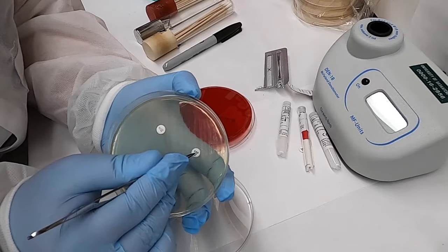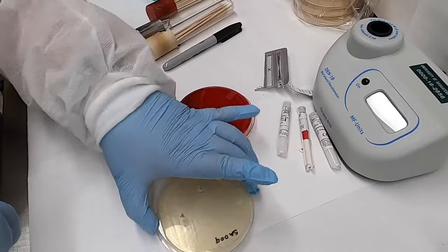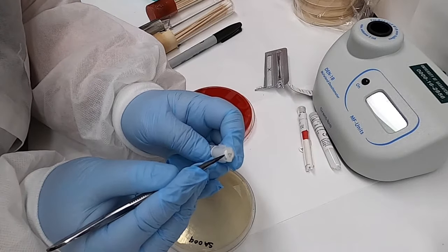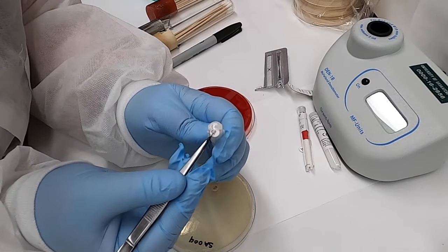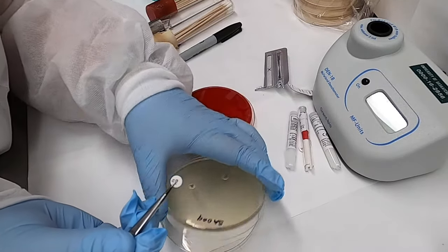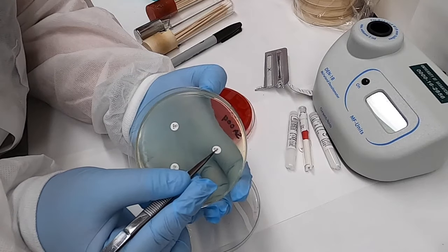So depending on how many disks are being placed on the plate, you may need to be aware of their relative placement to each other. You want to ensure that the inhibitory zones don't overlap, making measurement difficult or impossible.